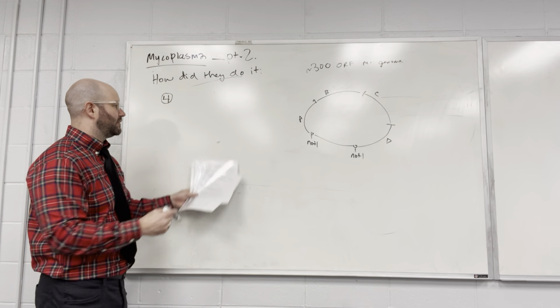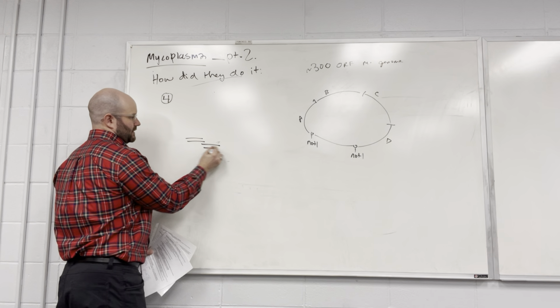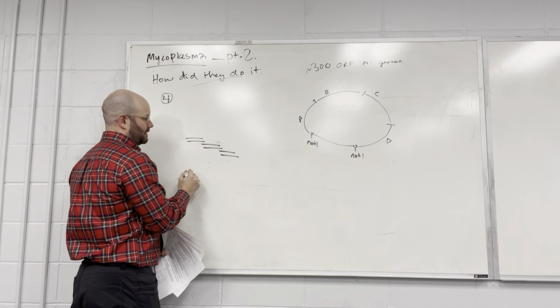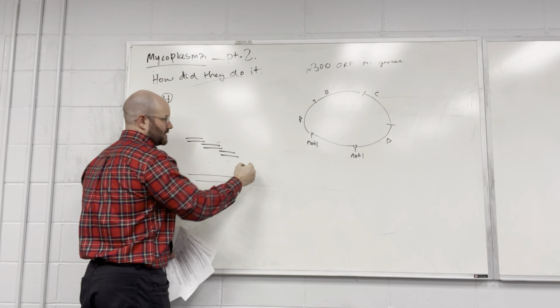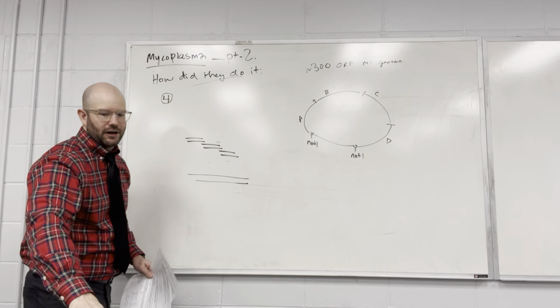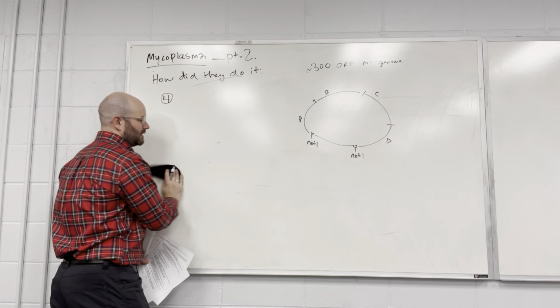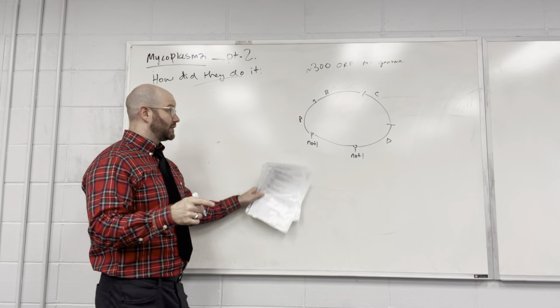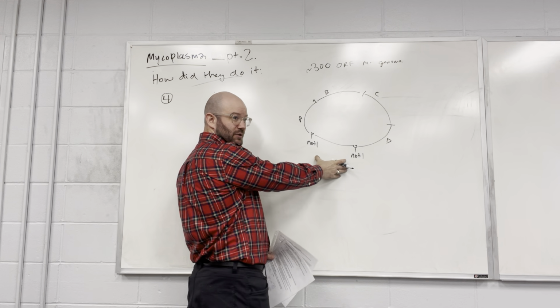So we've essentially only seen the first synthesis step, which was to take the little fragments to generate the larger fragment, which then got inserted into the backbone, which is that. How do you go to the next level of assembly at a larger level? You cleaved it? Yeah, so this is actually now where they are using restriction enzyme.